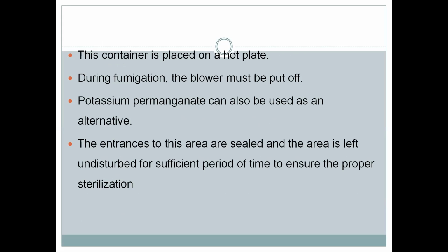Then the entrances to this area are sealed, and the area is left undisturbed for a sufficient period of time to ensure proper sterilization.